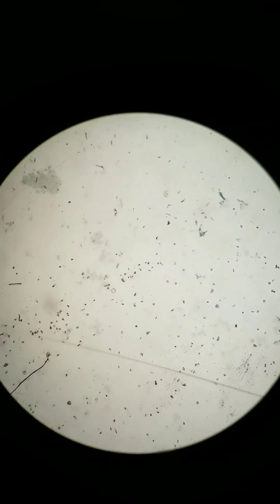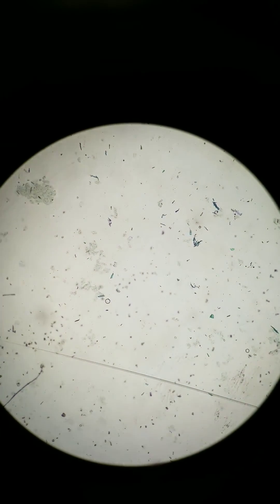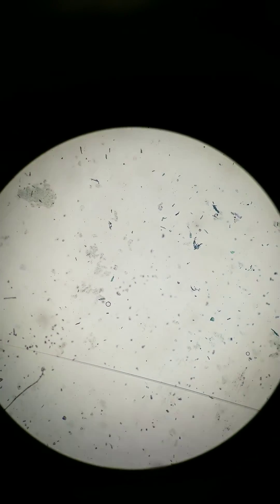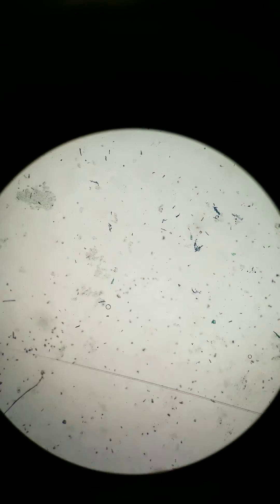Here I am at the scanning objective. I'm scanning, and you can see a bunch of cells here. There are other particles too, which are not cells. But hopefully you can at least see some cells.